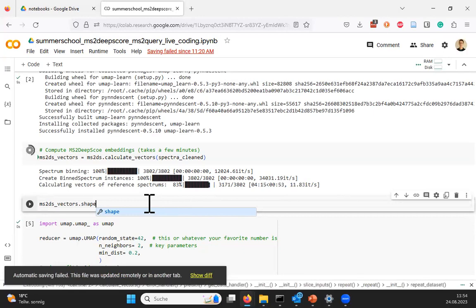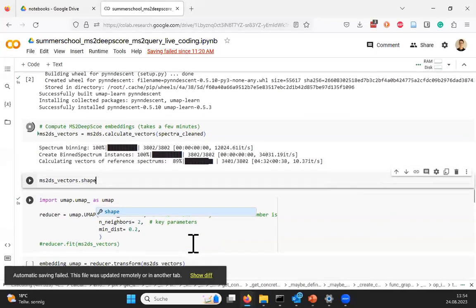Depending on the model that we use, in our case, they will be compressed to 500 numbers per spectrum, which is far too much. And we are going to compress this further with UMAP, if it works. And for this, UMAP will also take some time, of course.